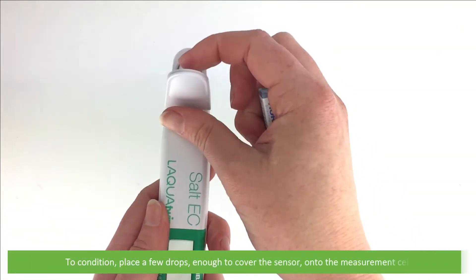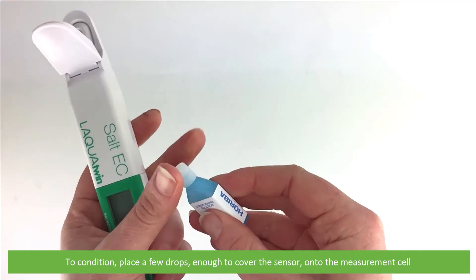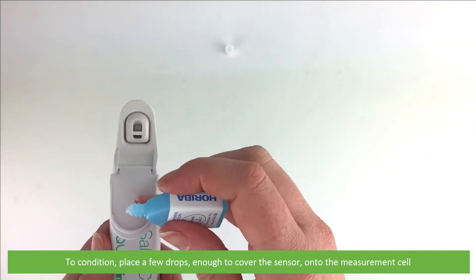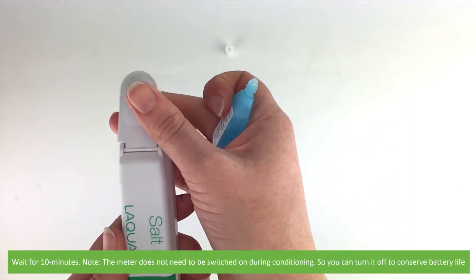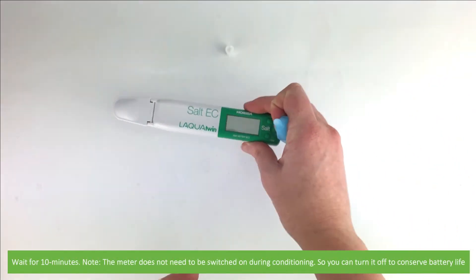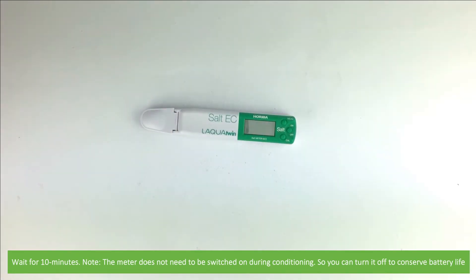To condition, place a few drops of the conditioning solution — enough to cover the sensor — onto the measuring cell. Wait for 10 minutes. Note that this meter does not need to be switched on during conditioning, so you can turn it off to conserve battery life.